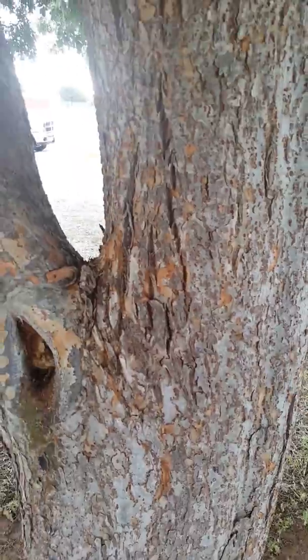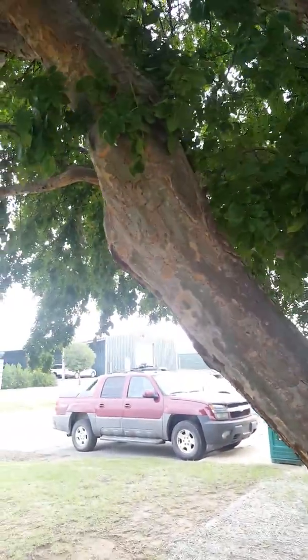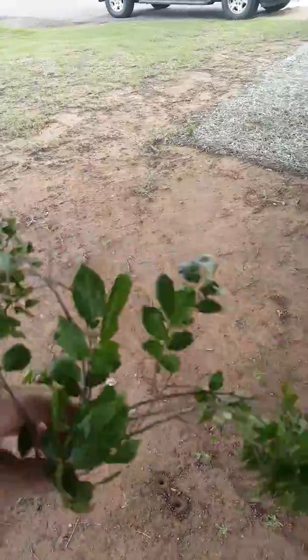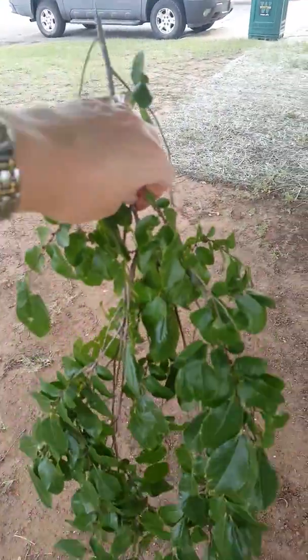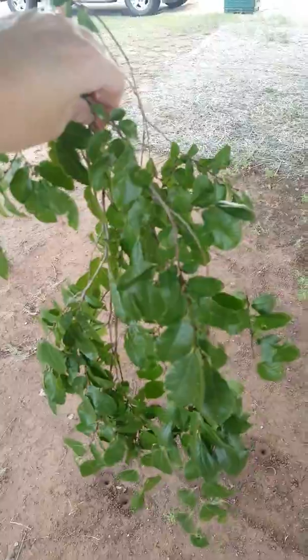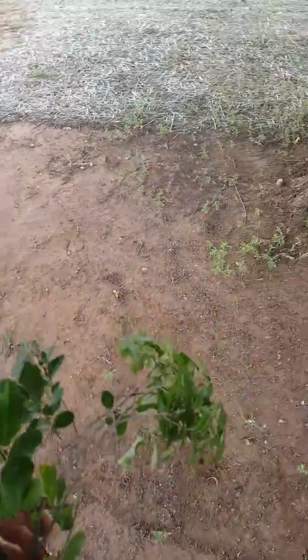So somehow save them in a folder or label them. To collect it, we're just going to use the pruning shears to get us a sample. Okay, so here's my sample that I collected. Notice it's fairly large, because you can take up plenty of room in the plant press, so you can get a nice big sample as long as it's not bigger than the plant press.